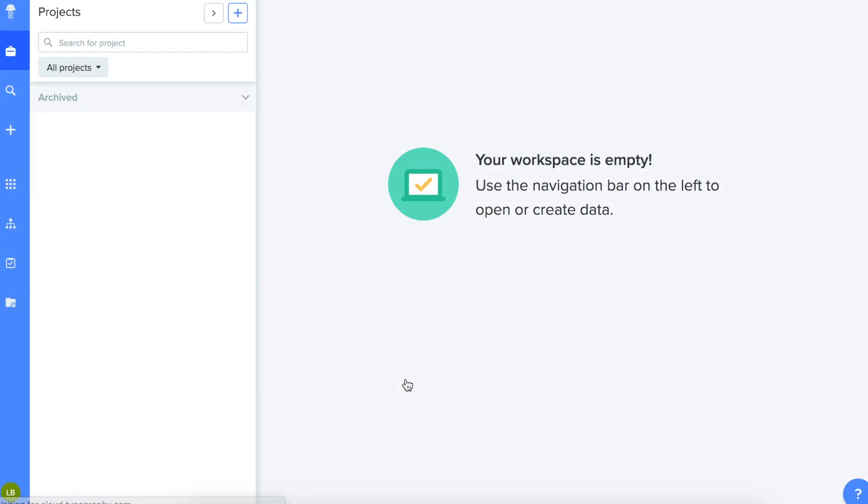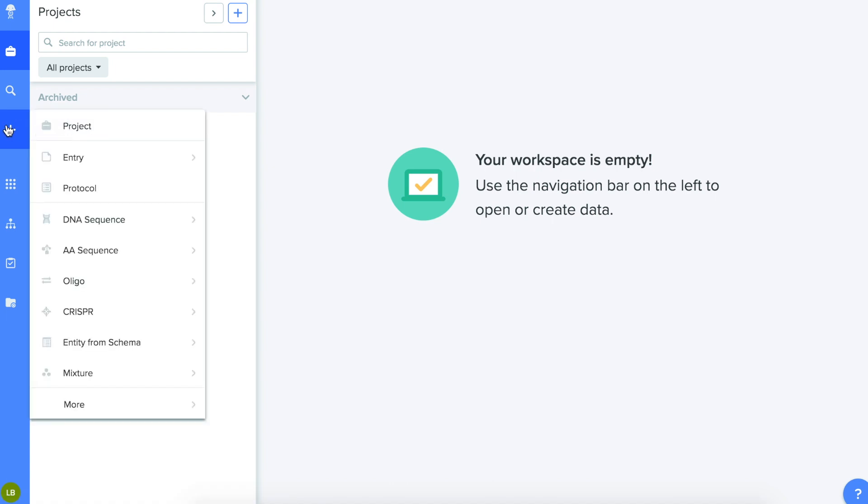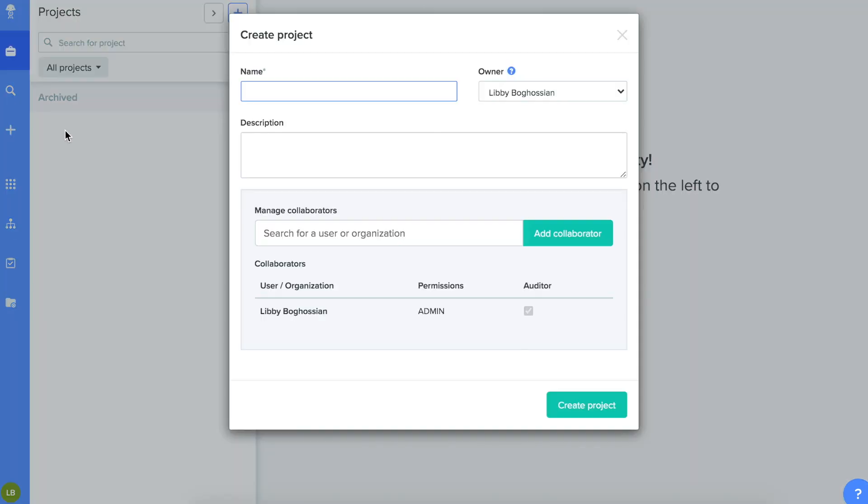You'll need to create a new project by clicking the plus sign in the upper left corner. Fill in the project information, then click Create Project.